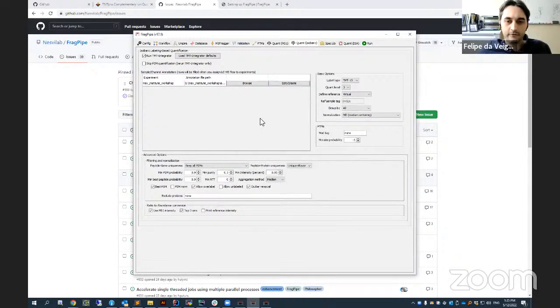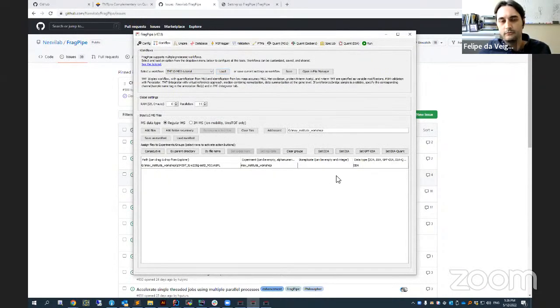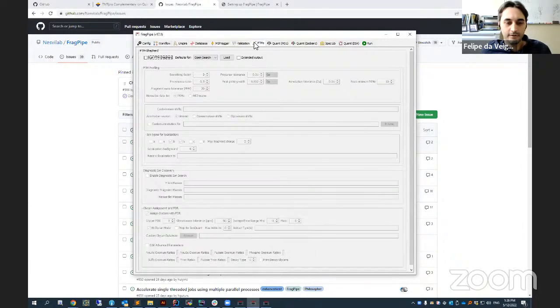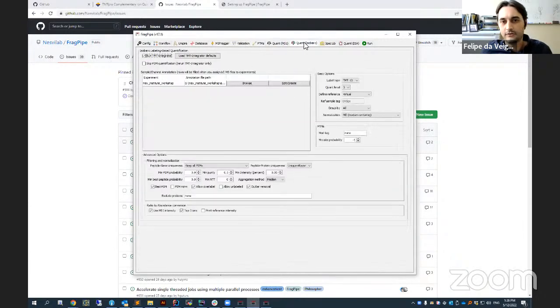The annotation file is basically a simple text file where each line has the TMT channels or the iTRAQ channels separated by a space, and then the label that you want to add. If you don't have the annotation file, nothing's going to happen.